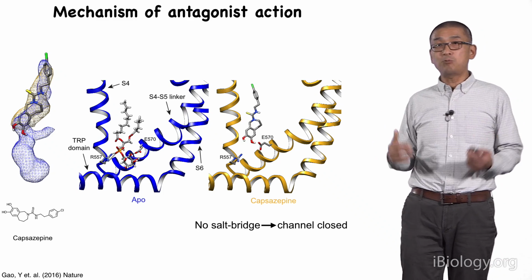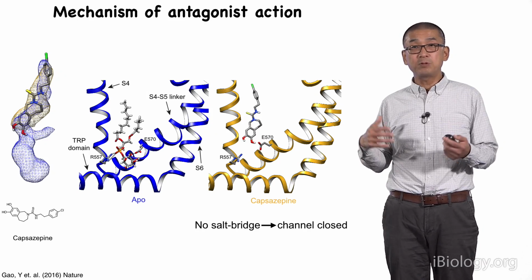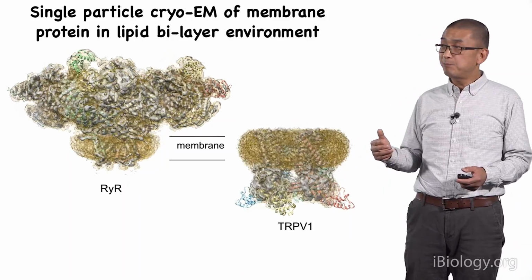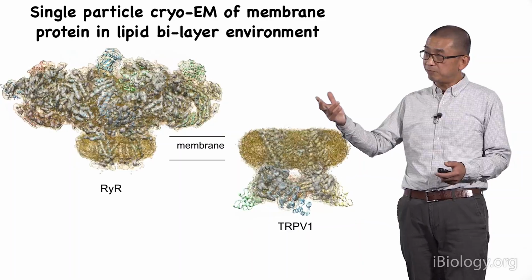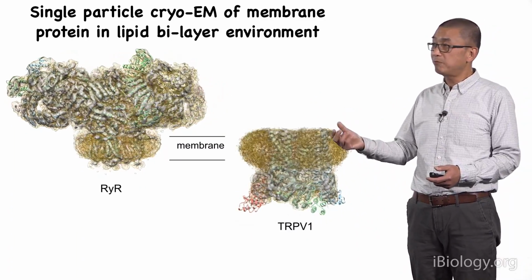Now back to the general question about how we can study membrane protein in a lipid environment. As we demonstrated here, the membrane protein can be put into lipid nanodisc to study its structure, facilitating the structural determination of a membrane protein in a lipid environment.